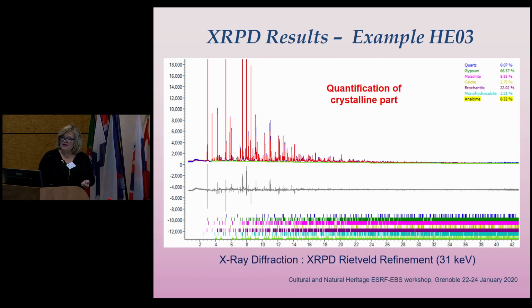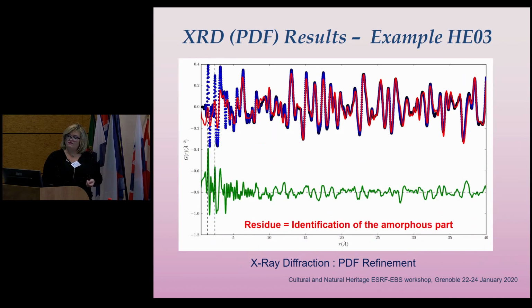Here is an example of a sample, with the patterns, how good they look, only here, because with the resolution of our instrument in Unimore we couldn't have these results. All these results were and still are elaborated with Rietveld refinement to have a good answer.